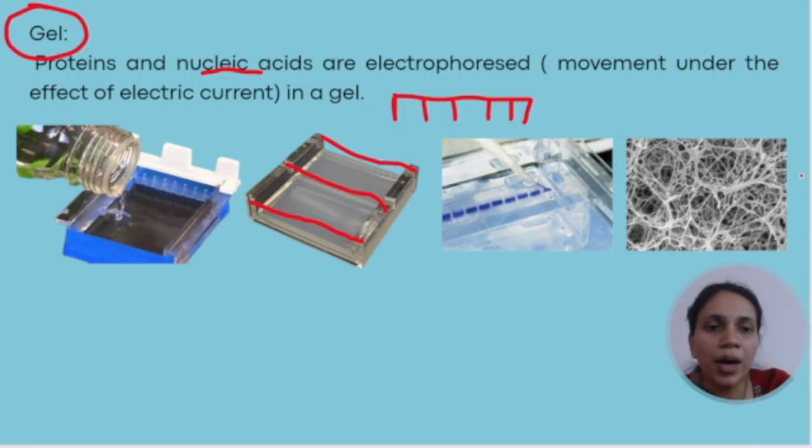And now if you see microscopically, we will have something of this sort of look. The gel that we have will have something of this appearance. And if you see, there are some pores here of different size. Depending on the size of your DNA or whatever nucleic acid we are separating, it will pass through this and reach the destination. So this is the nature of the gel.